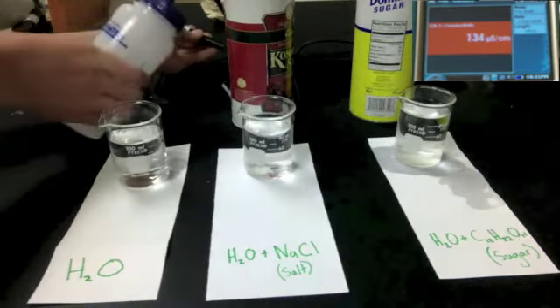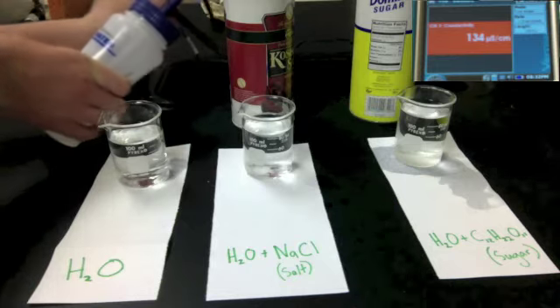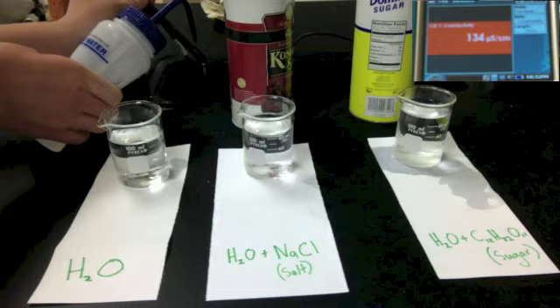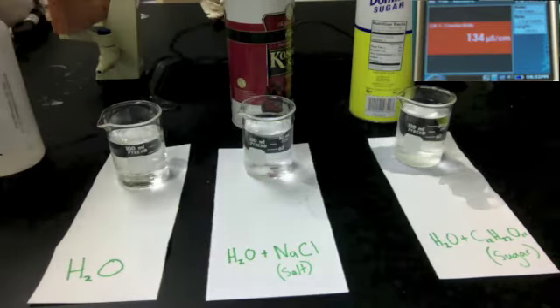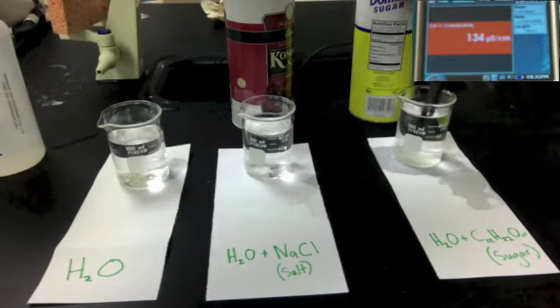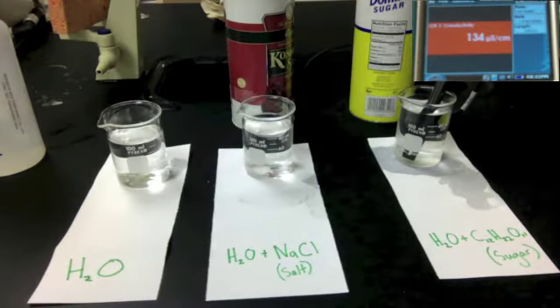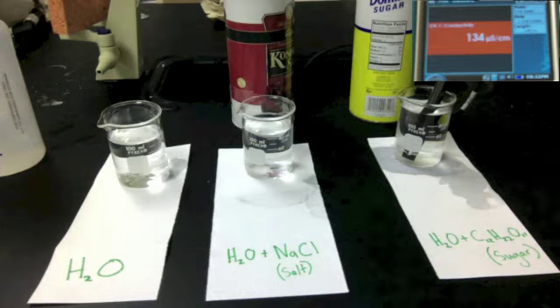Now we rinsed the conductivity probe again with deionized water and stuck it into the sugar solution. And as you can see, the sugar solution, sugar which is a covalent compound, the conductivity is the exact same as the deionized water on the left.